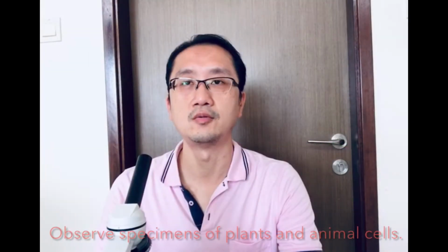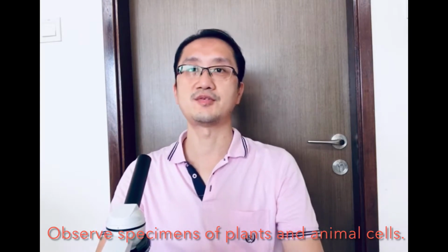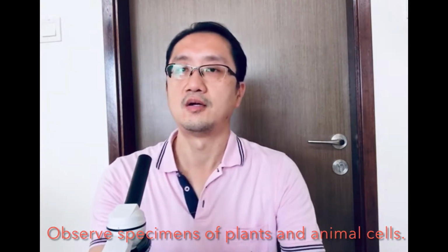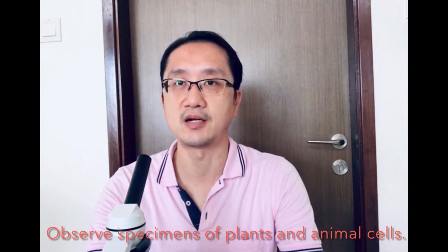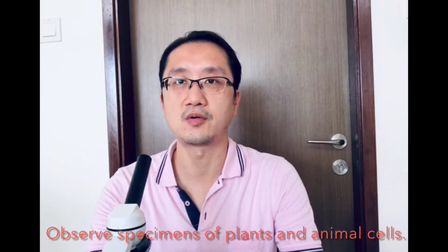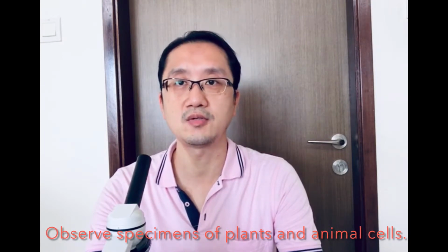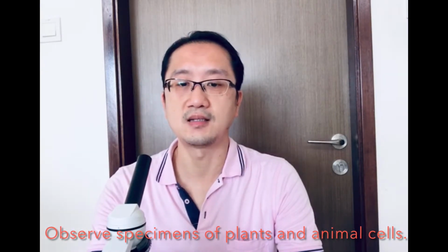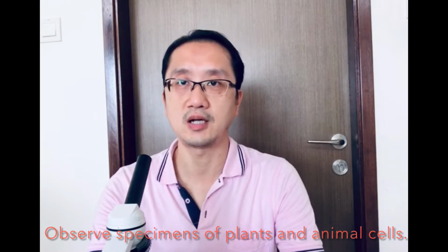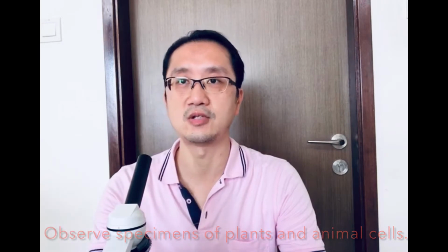Students, today we are going to move on to our activity to observe and evaluate the parts and functions of cells. For finding out about cells, definitely there are many different types of cells with many different parts and functions. So what we're going to do is look at some real-life specimens of plant and animal cells using our trusty microscope and some prepared slides. I'm going to give you instructions on how to look at it, but basically what I will let you see is actually what I see through my eyepiece over here.